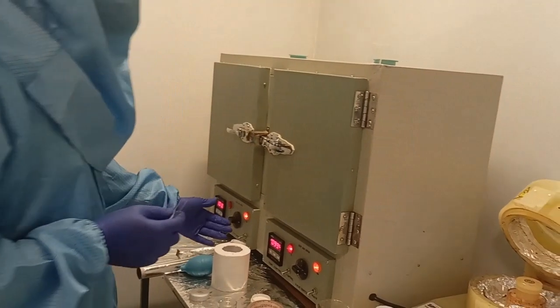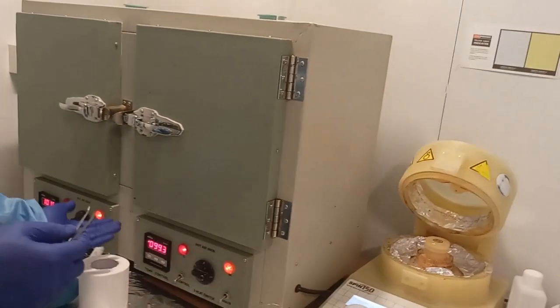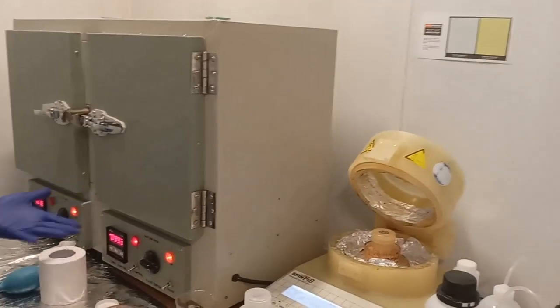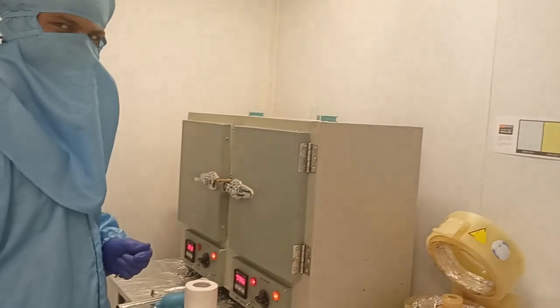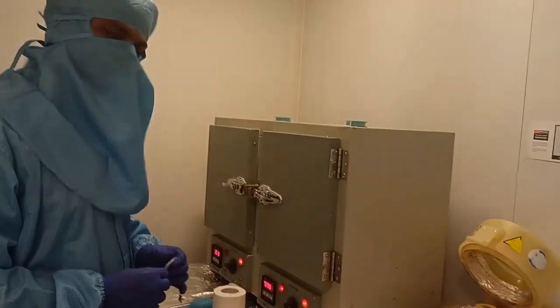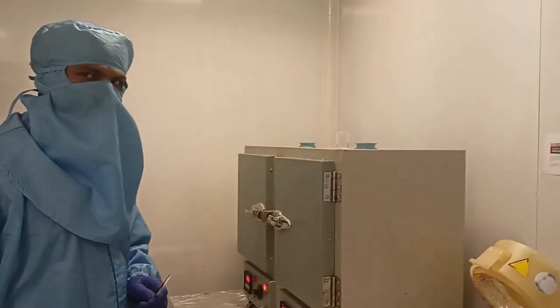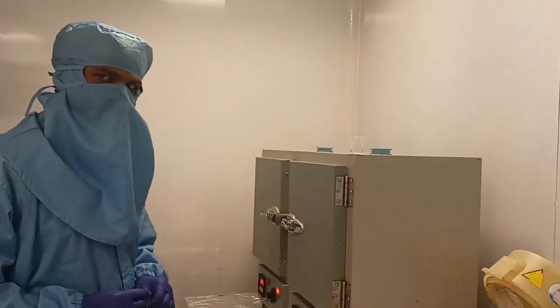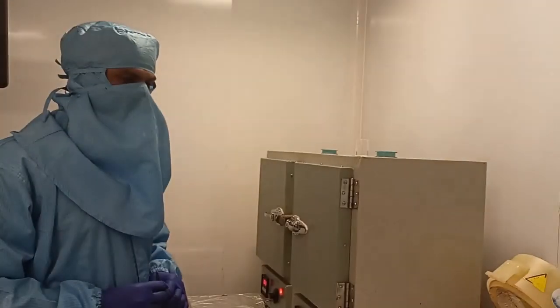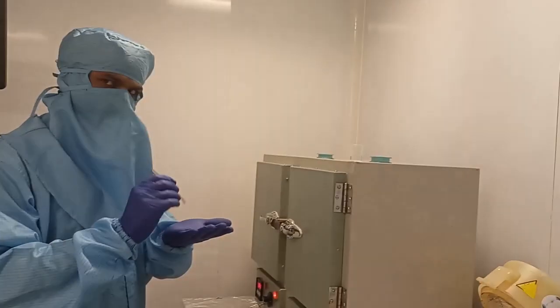As you can see, it is already at 100 degrees. Now it is 99. So we are baking it at 100 degrees. For how much time are you going to soft bake it? Around 10 minutes, because it was optimized for 10 minutes. If I use more than 10 minutes, the photoresist may burn. And what if it is less than 10 minutes? Even now you can see it is a little liquidy.